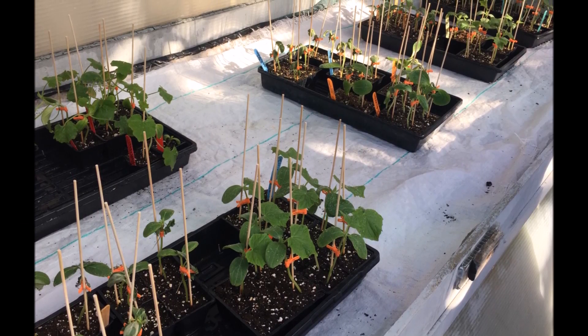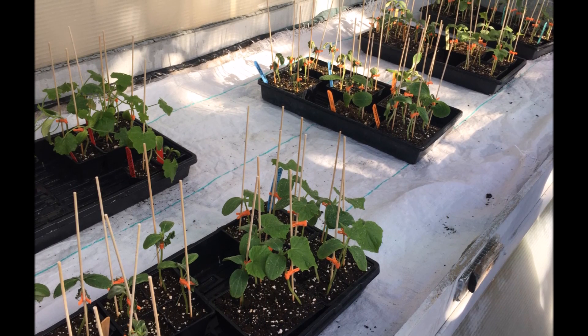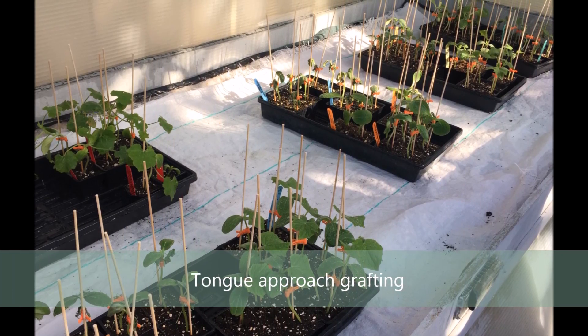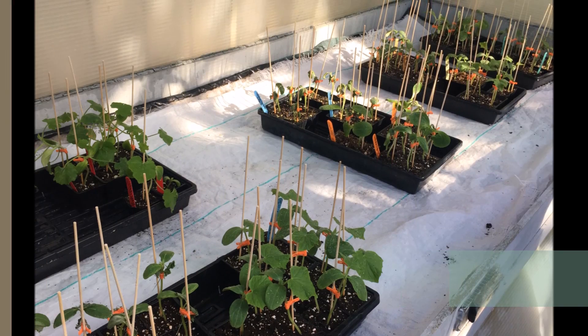Hello and welcome to this little video on grafting cucurbits. The experiment goal is to test the viability of the cucurbit unions using the tongue approach grafting. Basically, a good graft occurs when two plant tissues are joined together and heal successfully to form an entire functioning plant.